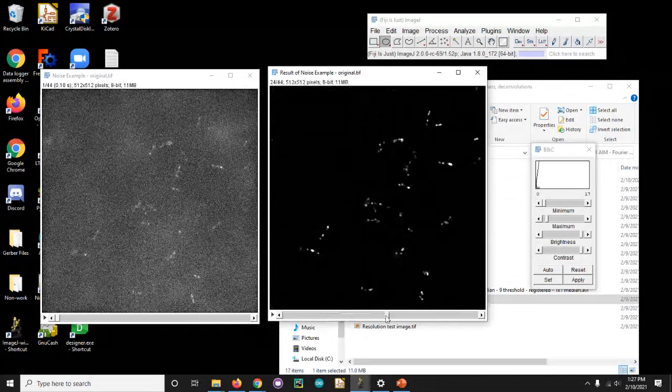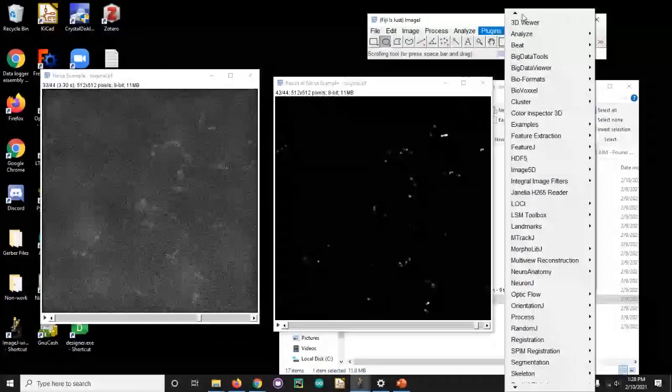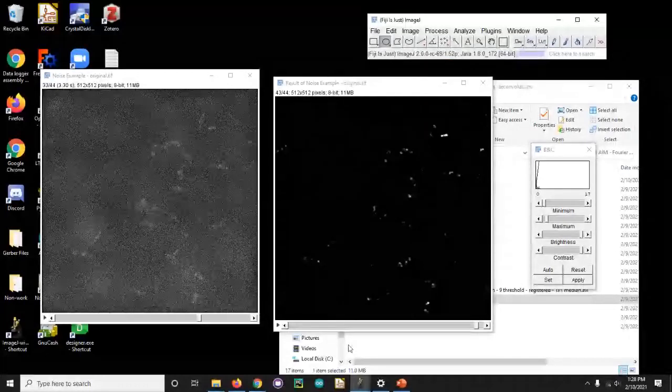So this is just something to keep in the back of your mind: even things that look very intractable like this, as long as you understand what these filters are doing, you can start to think about how to define this removal. And the nice thing is, all you have to do in the end is go to your macro recorder tool, perform those steps, have them as a macro, and then you can just run those steps on every image automatically. Then all of these images that originally look like this will be filtered out, and now you can do your analysis. Okay. So any questions on that?